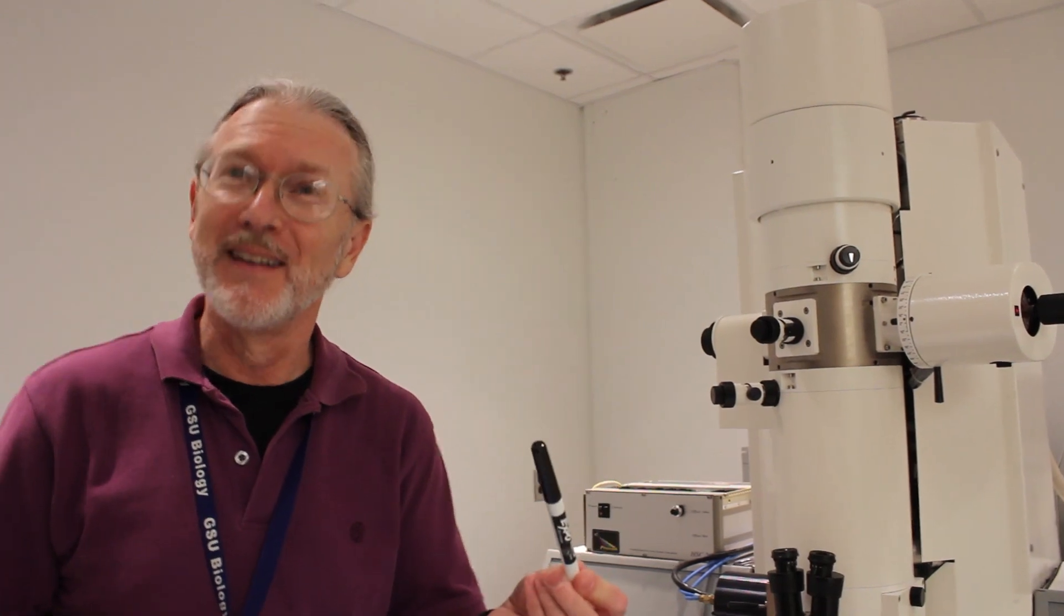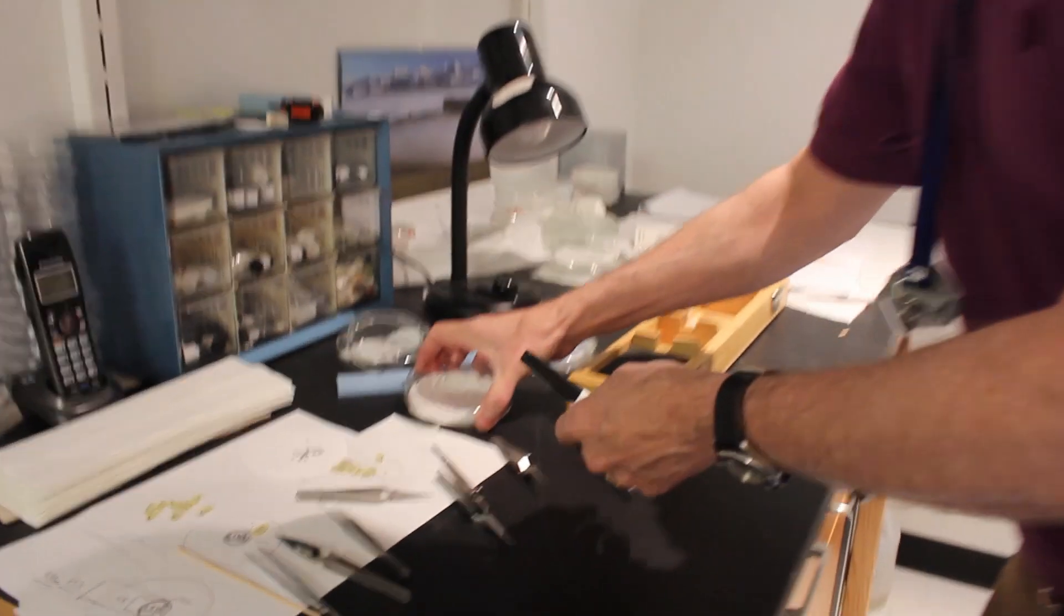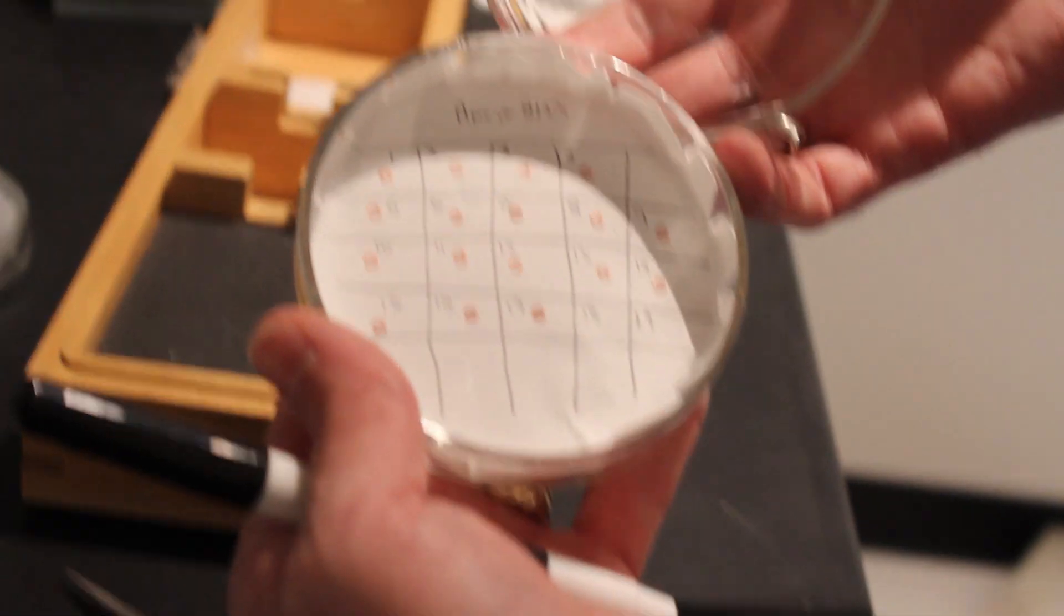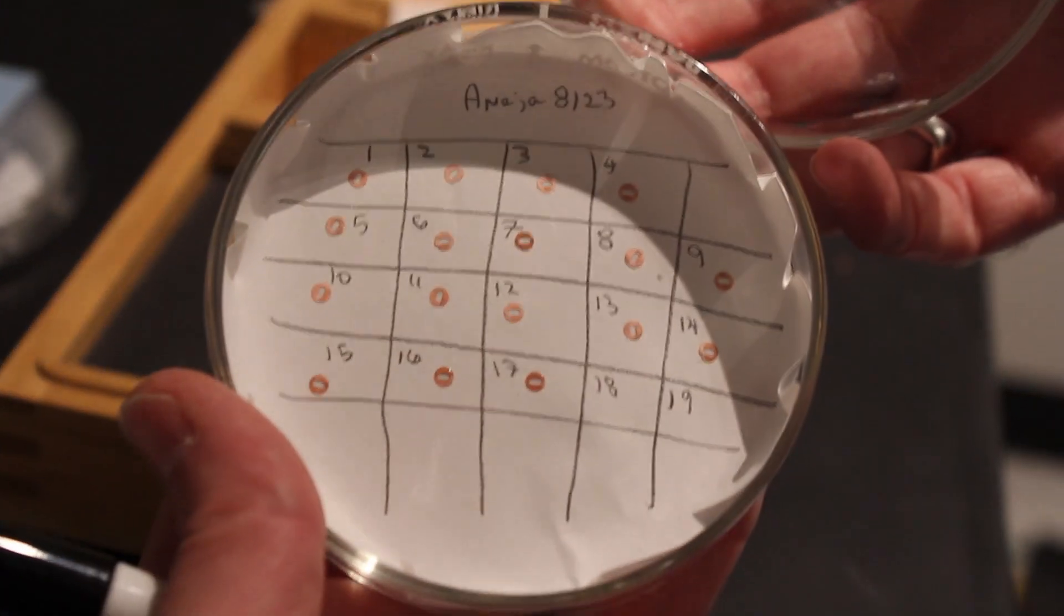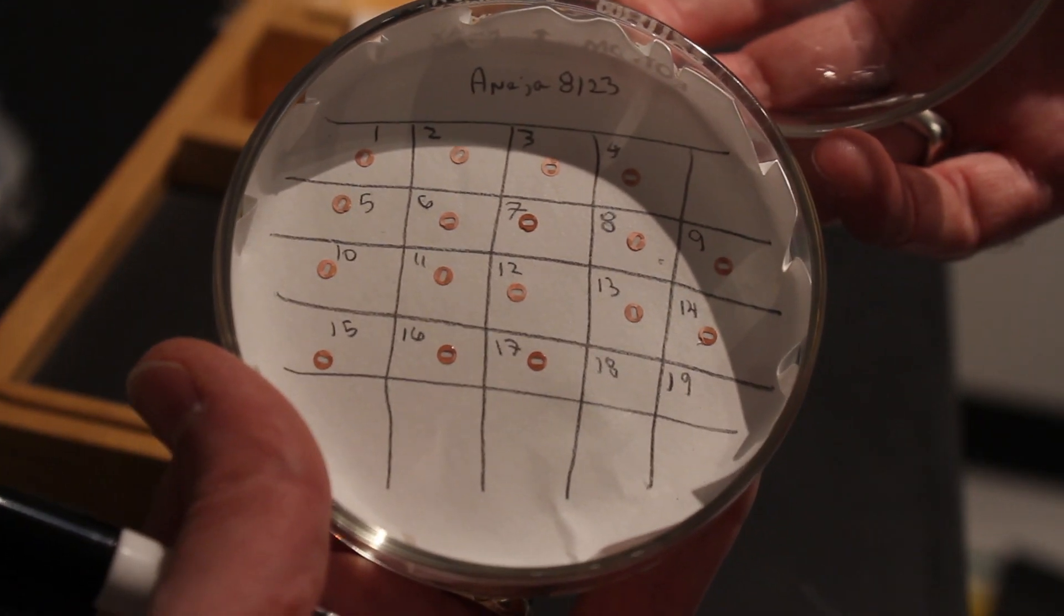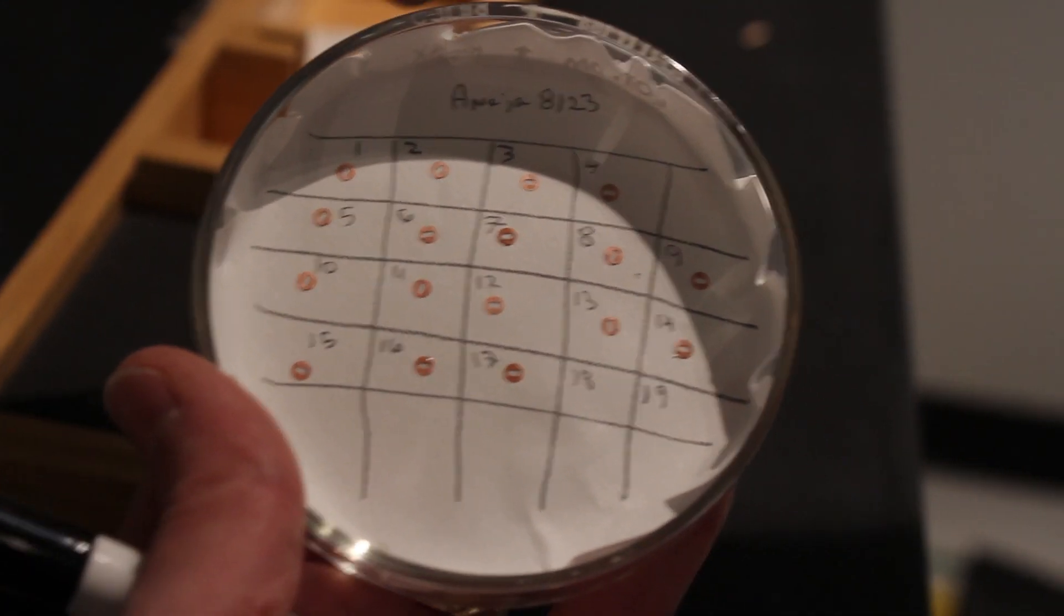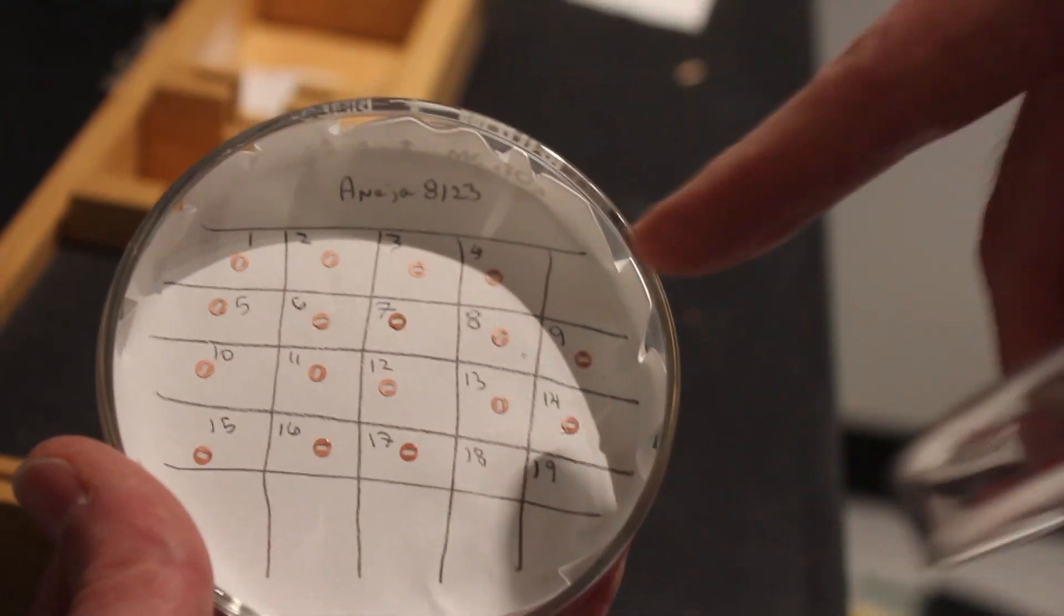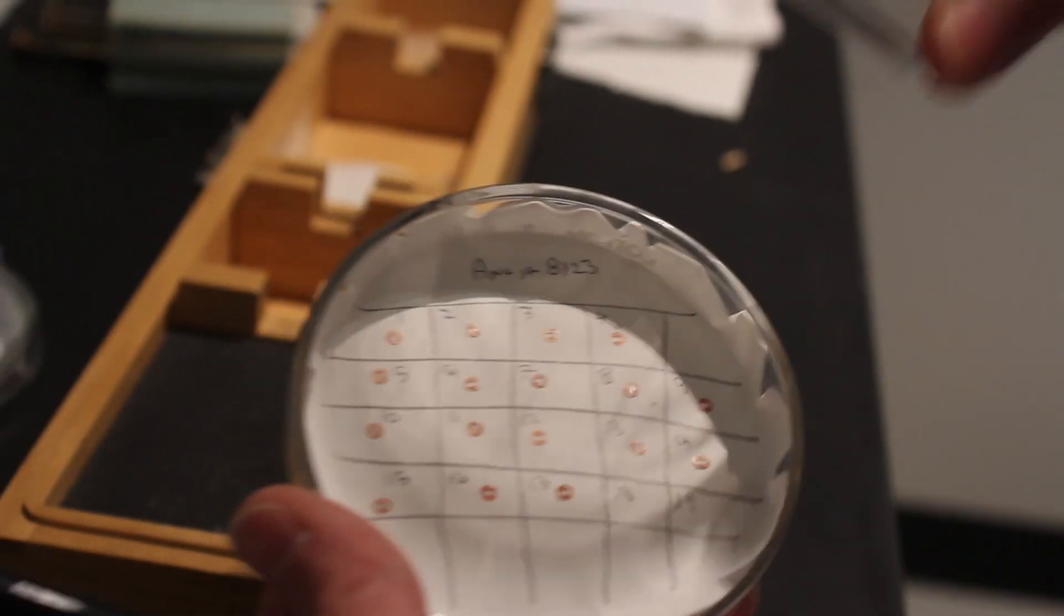How can you manipulate something that thin? With amazing skill and dexterity. Now they go on to these, what's called a slot grid, and there are half a dozen sections on each one of those grids. And they're all in order, so I can track a structure from number one all the way through number 17.